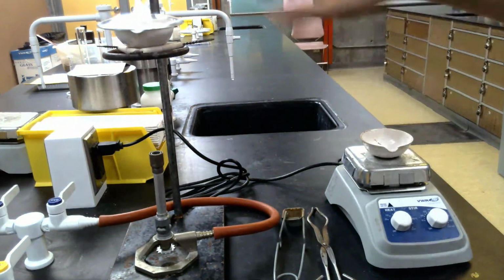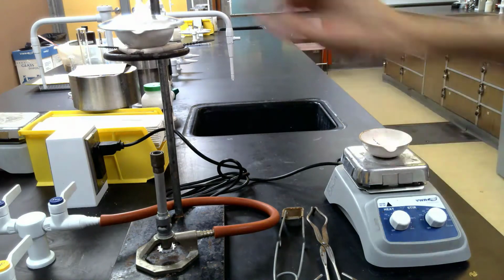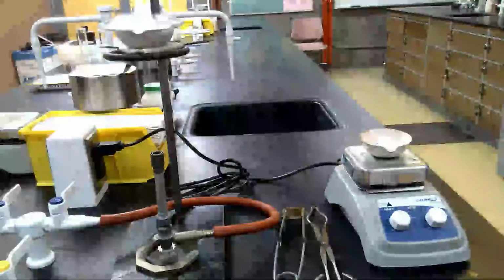Now, because the salt water is covered with a watch glass, I'm going to heat it with a lower flame to reduce spattering, and I'm going to heat it at least until the watch glass here looks dry. So as the heating process occurs, I'll see droplets of salt water forming on the watch glass where it's spattered. When I look down through the watch glass and see that it's totally dry, then I'll know it's probably time to go ahead and cut the heat off. So with that, I'm going to start the heating process.